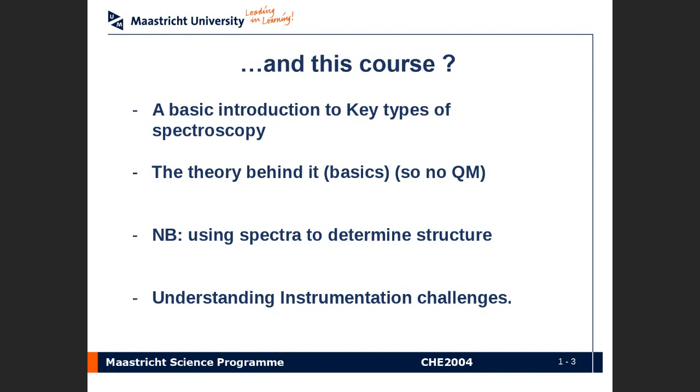You have spectroscopy courses that are very heavily laden with quantum mechanics, and that's not the case in this course. This is a very simple and accessible spectroscopy course where the emphasis is on trying to interpret a spectrum more than the theory.